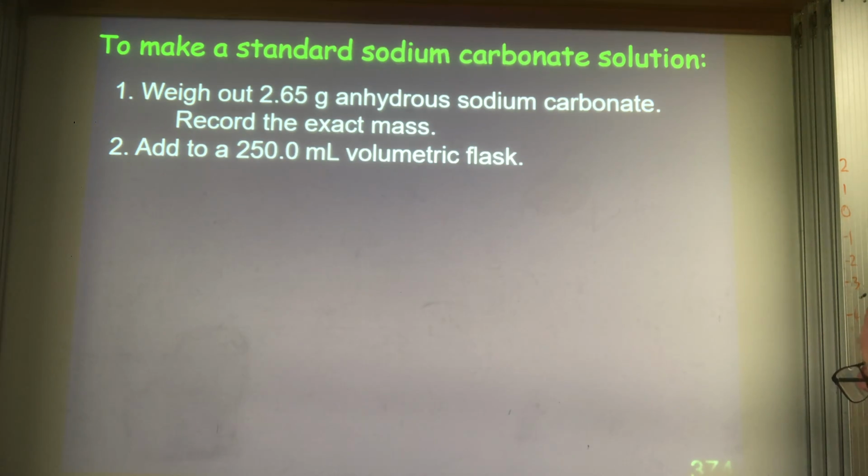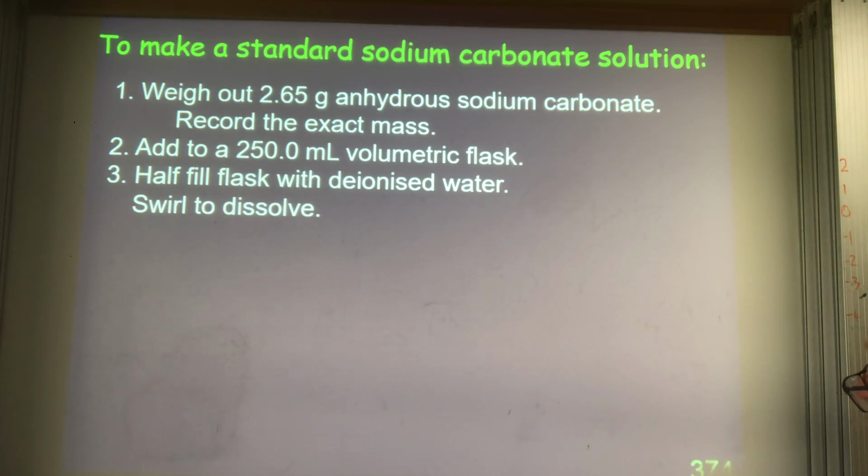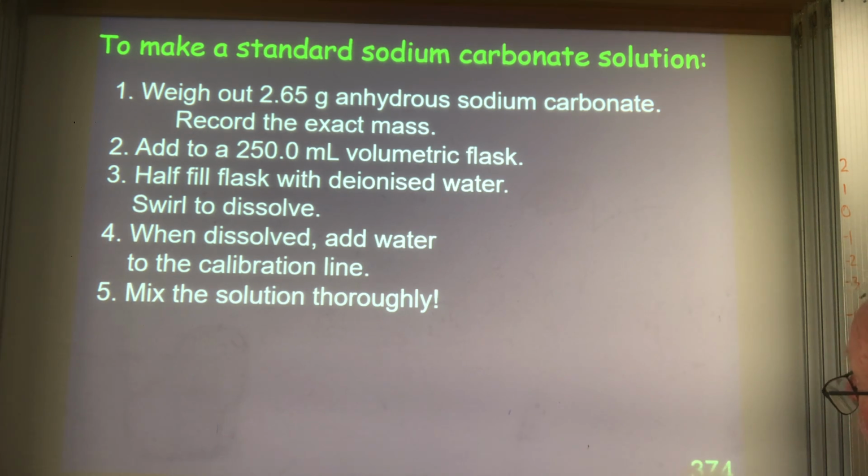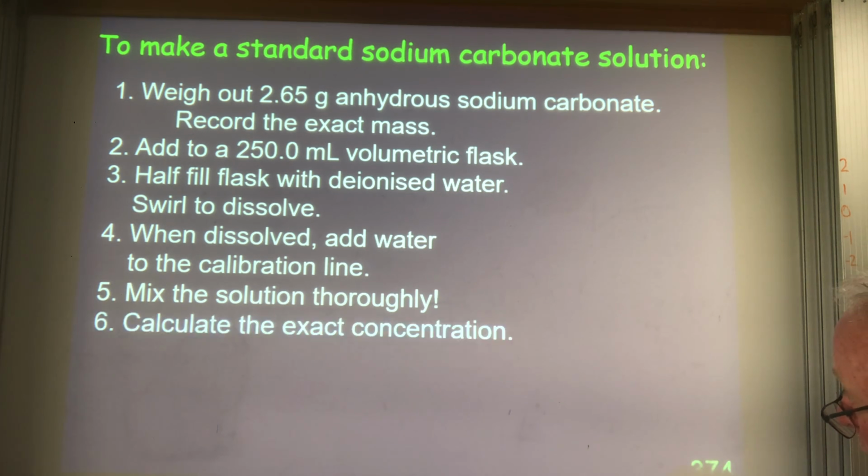Now there's a process of working out a standard sodium carbonate solution. If it was in class, I'd actually get you to do this now, chuck your lab coats on, etc., and make your standard sodium carbonate solution.